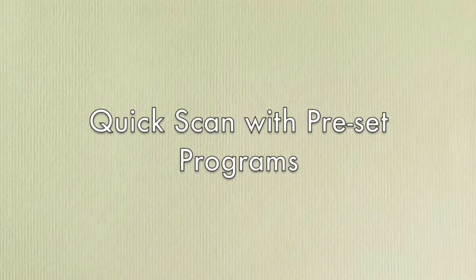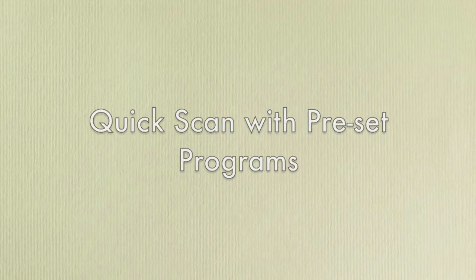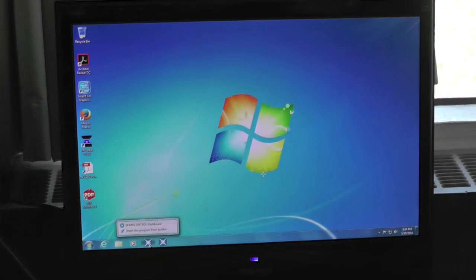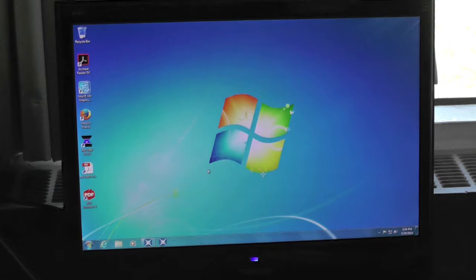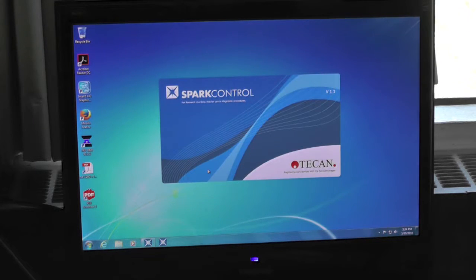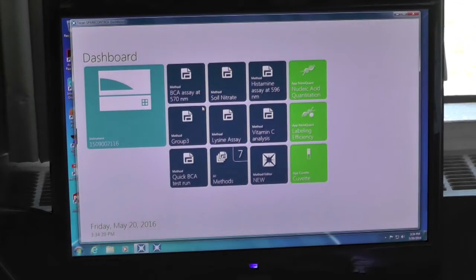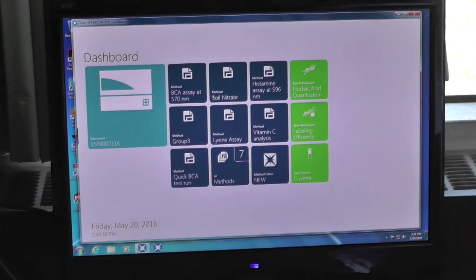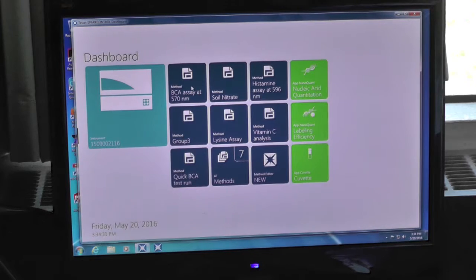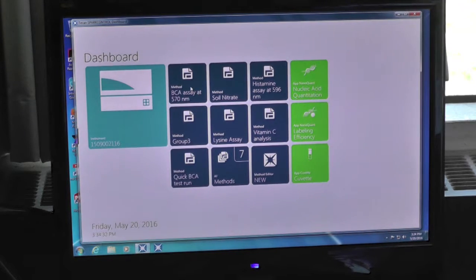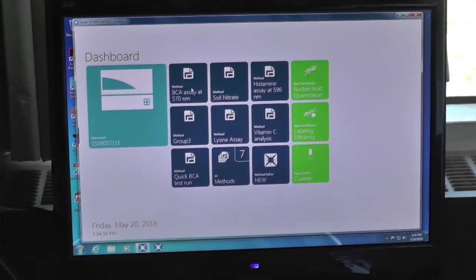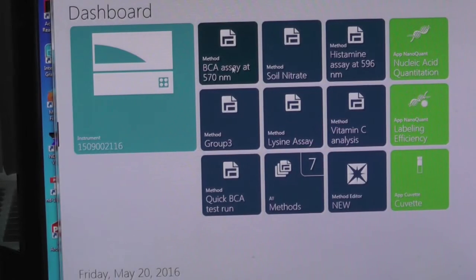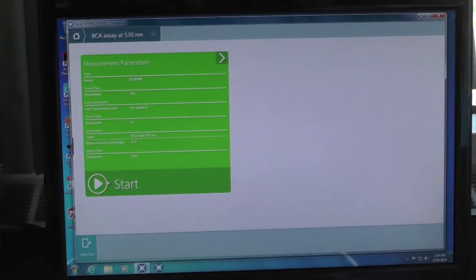Quick scan with preset programs. Click on SparkControl icon on the taskbar to initiate the program. You will arrive at a screen where you can choose from several pre-programmed assays. We will use BCA assay at 570 nm as an example. Click on the preset program.